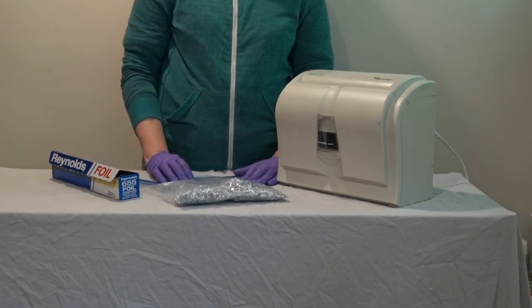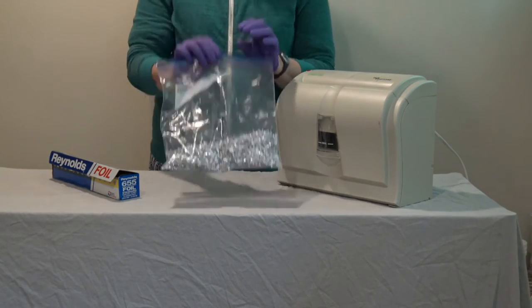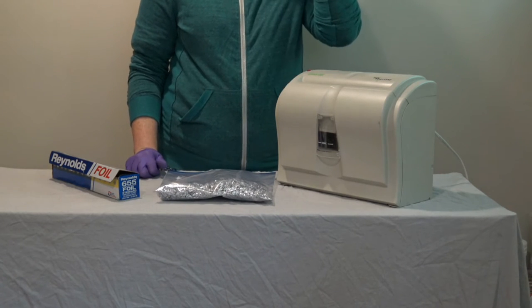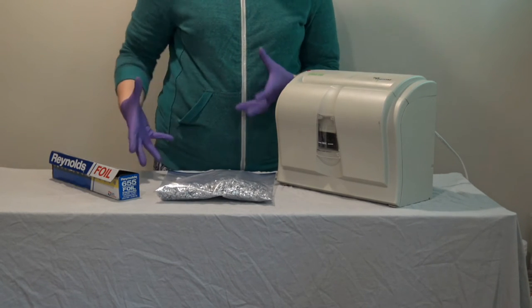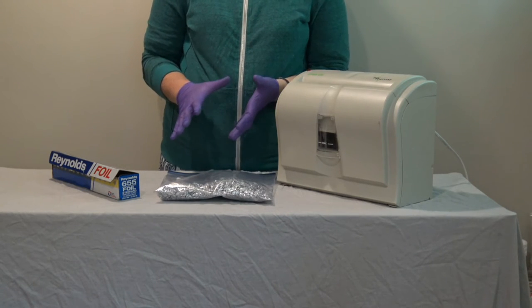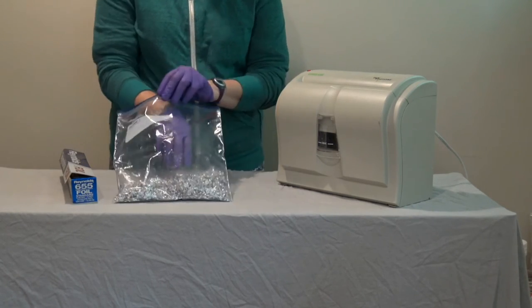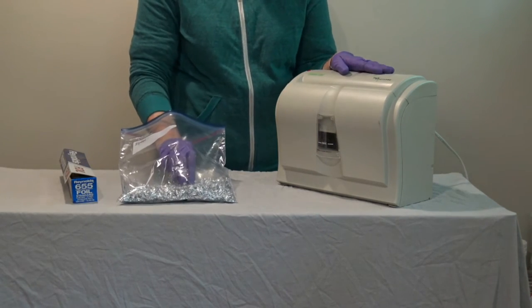It will be very important to have lots of shredded aluminum foil on hand. We shred the aluminum foil so that there is a lot of surface area in a relatively small volume, because aluminum foil is very lightweight. And so I have here a cross-cut shredder.